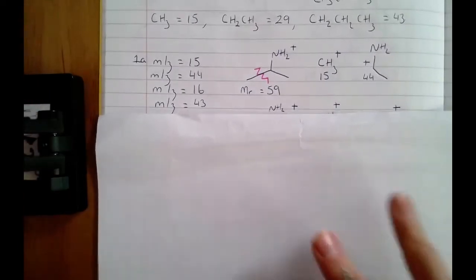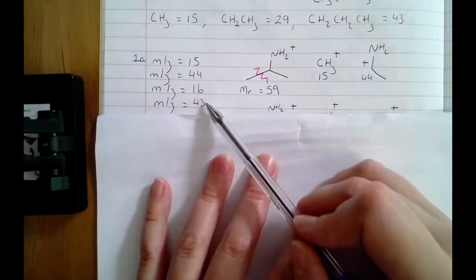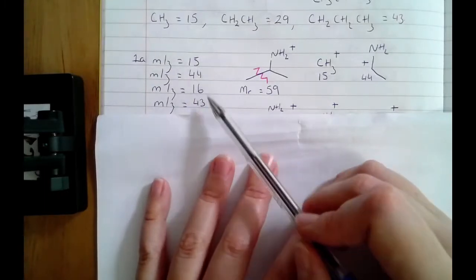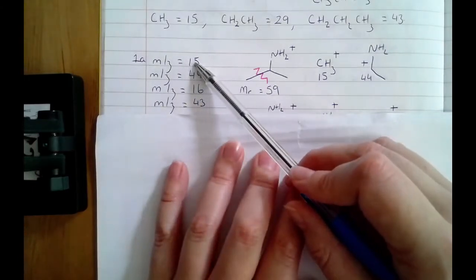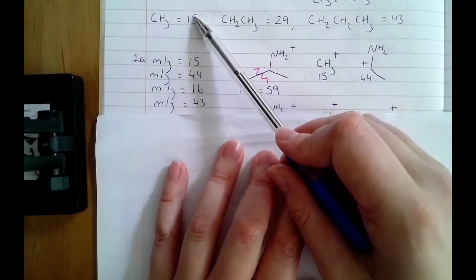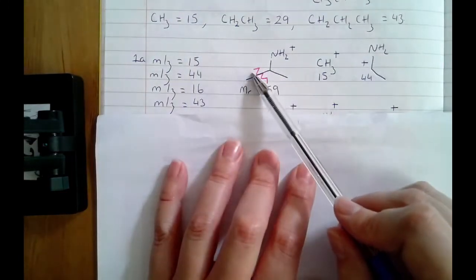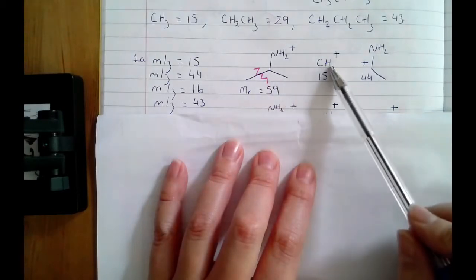In the first question, I give you 2-aminopropane, and I give you 4 different peaks, and I ask you to come up with fragments that will be responsible for those peaks. Okay, so the first peak I give you has a mass of 15. We've just seen that 15 is typically a CH3. I need to confirm that it is possible to break a CH3 off the molecule. So if I have a look here at the molecule, if I were to break this bond here, then I would produce a CH3 fragment.